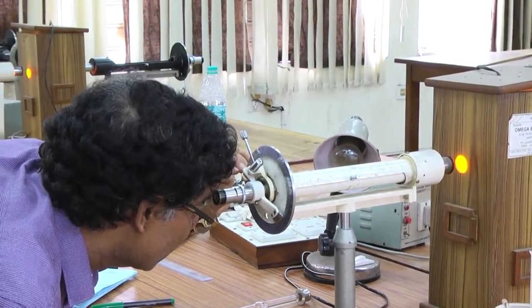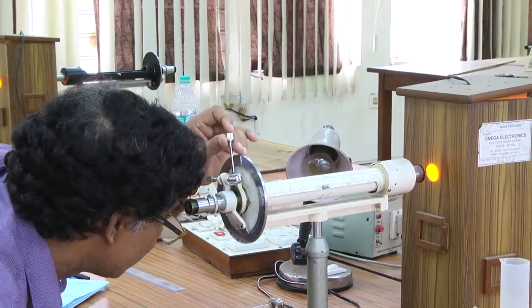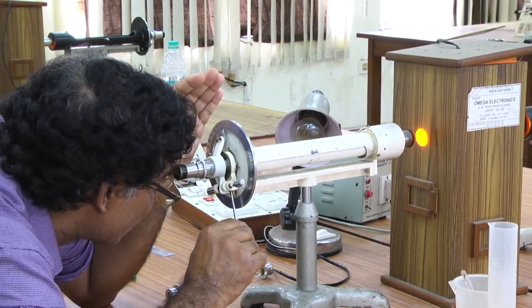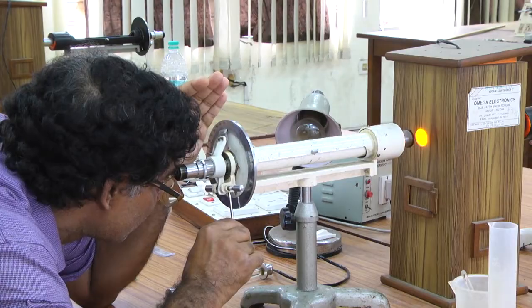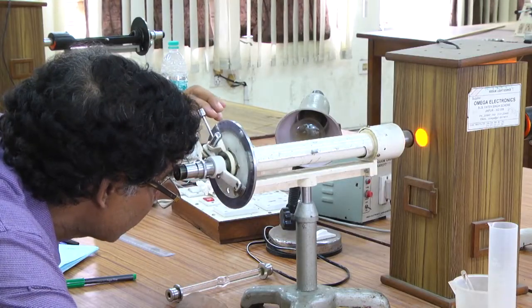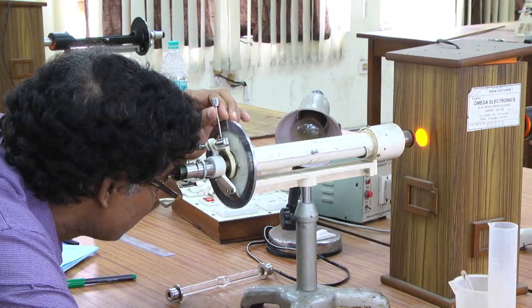Anyway, so if you bring this, go to the first illumination and find it, okay. I think this would be the first illumination, then note it down, go approximately 180 degrees, and there for the second illumination you take the reading.